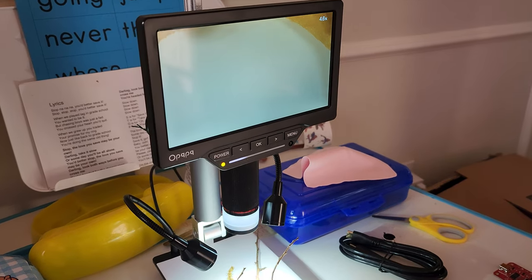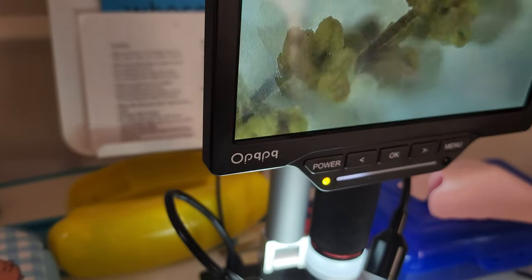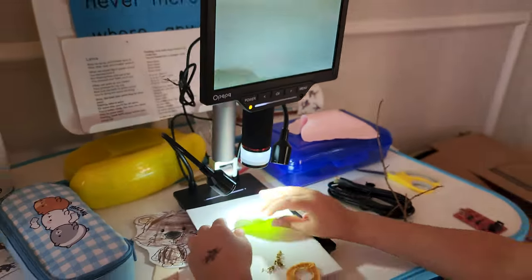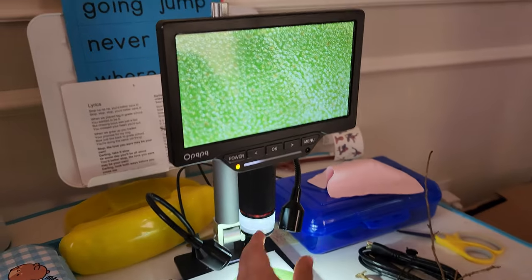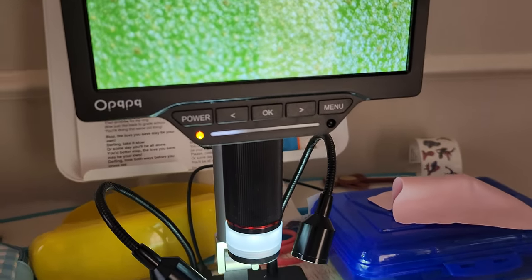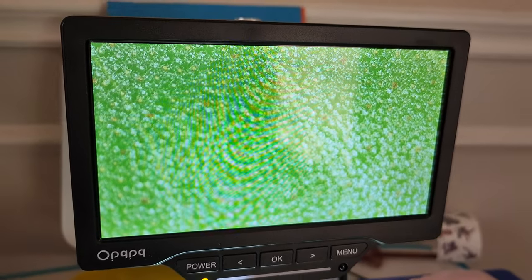My son asks: "Daddy, can we zoom into the leaf now?" Yeah, let's load up the leaf. Let's take a look at the leaf. It's so easy that kids can use this microscope flawlessly. Oh, look at that — that's pretty. You can see the cells. Look at that. Each one of those dots is a cell. You see that? How neat.